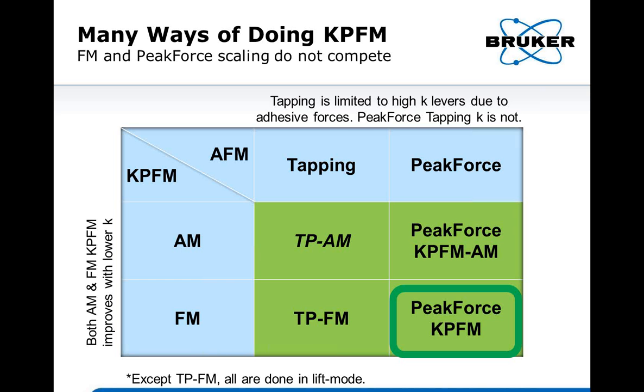On the AFM side, tapping mode used to be the dominating mode in ambient. 2 years ago, Bruker introduced PeakForce tapping mode. So now we just have more ways to do KPFM.